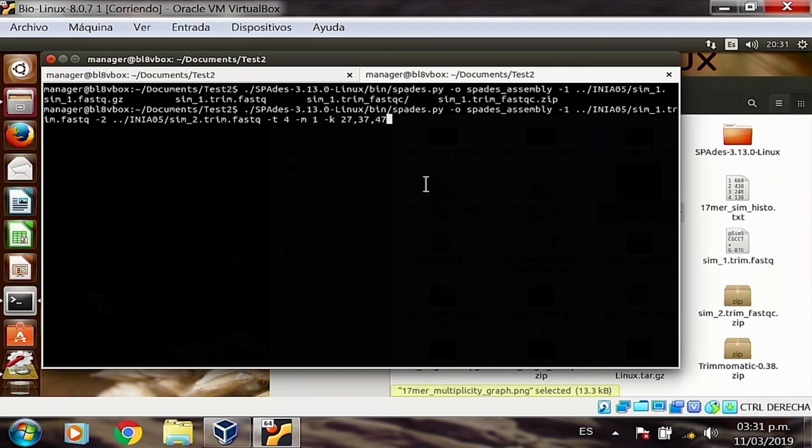And the other thing is that if you have an error that says file doesn't exist, please read your errors to know what's wrong. If they said file doesn't exist, that means that you have the wrong path to the file. So you have to double check where you are and where the file you want is.